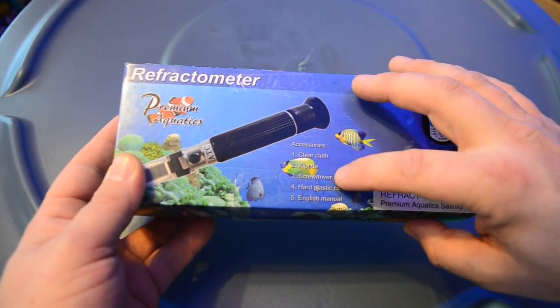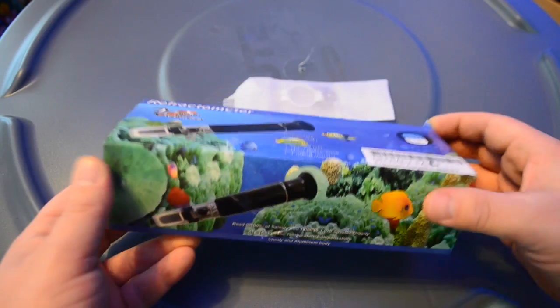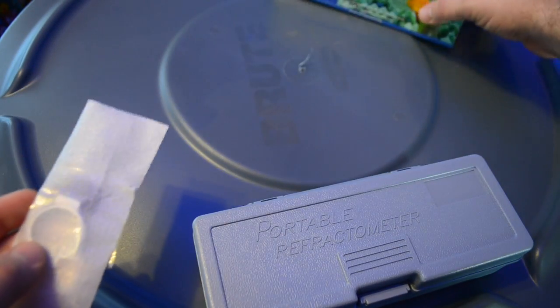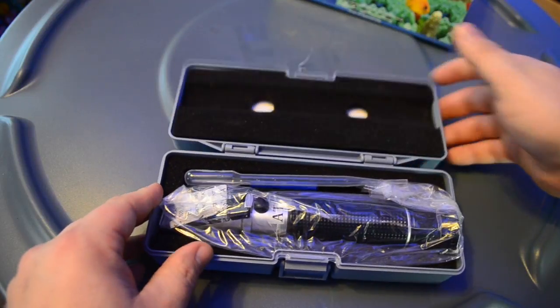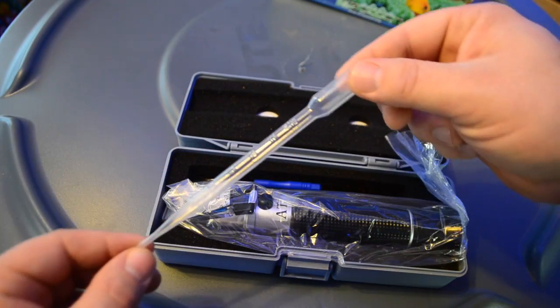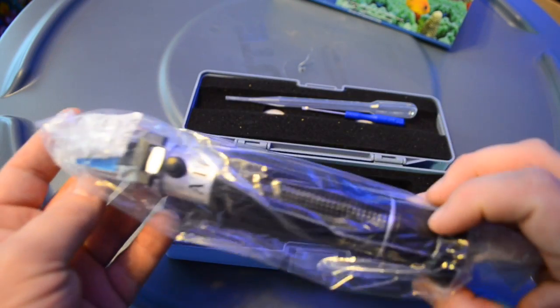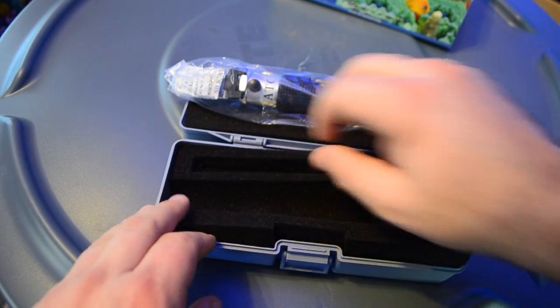You're going to get a cleaning cloth, a pipette, a screwdriver to calibrate your refractometer, and a hard plastic case as well as the manual. It also comes with a cover attached to the top — this is a replacement, so if you don't want to use the LED, you can put that on there and get better results. The refractometer itself is a little bit bigger than a lot of the other ones I've seen, it's a good size and will sit in the hand well.